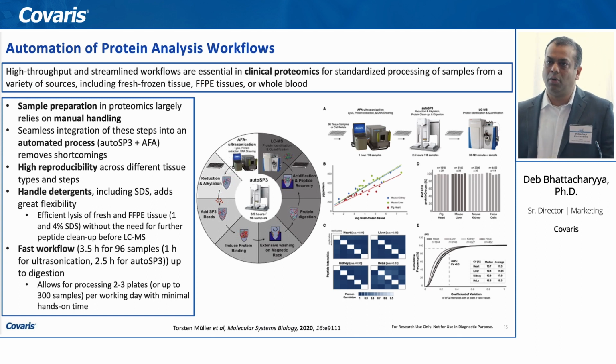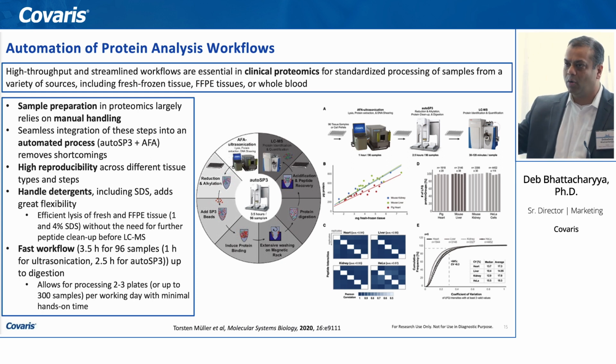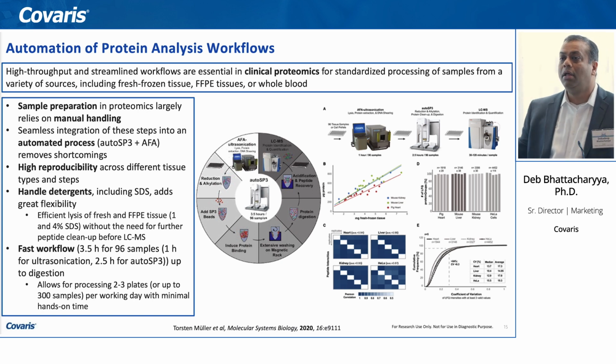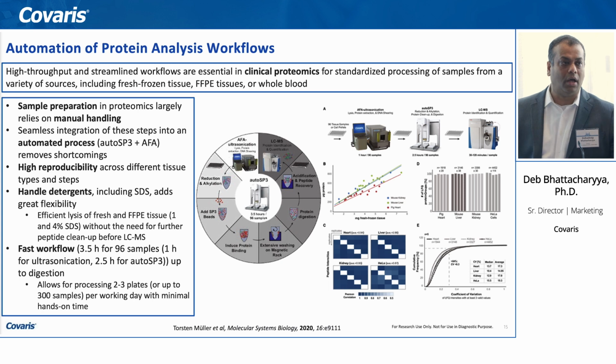He did the whole thing on an automated workflow, using an Agilent Bravo. So the entire process, from tissue deparaffinization and tissue disruption/lysis through the whole workflow, can be done, resulting in him reporting all the additional peptide IDs that he found, and also the higher yield of proteins that he got.